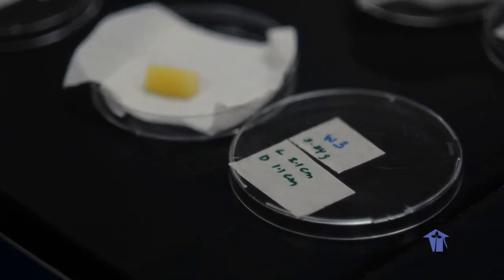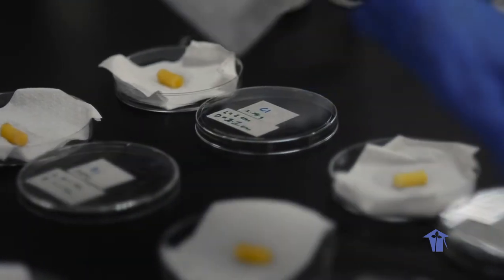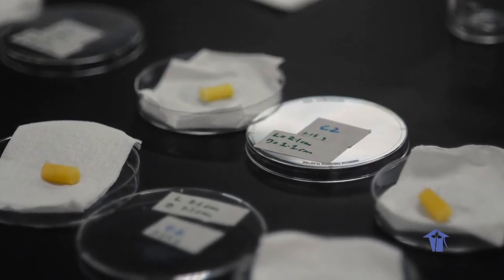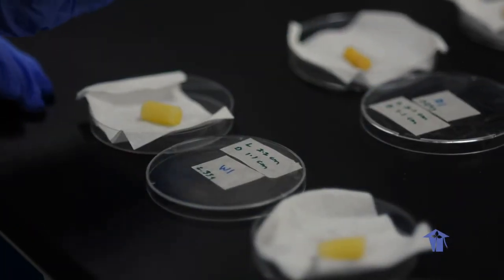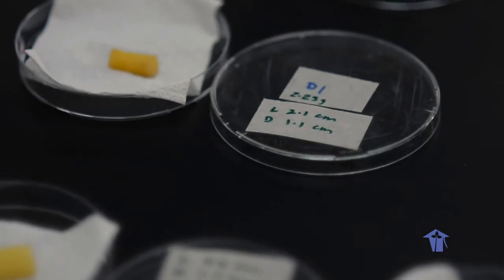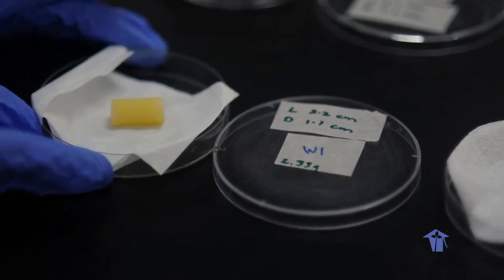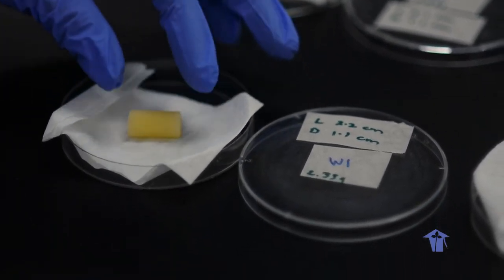The original dimensions at the start of the investigation are written for each one of the tubes on their Petri dish covers next to where you're seeing the potato strips. What we are observing now is the result after the strips had been left soaking in the solutions for approximately 1 hour. You should be able to observe that the strips that had been placed into the distilled water are now quite a lot larger than they were originally.